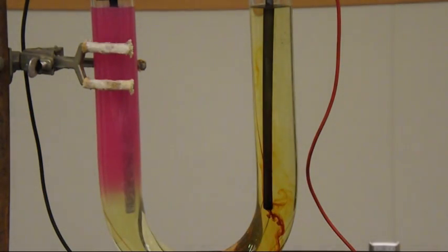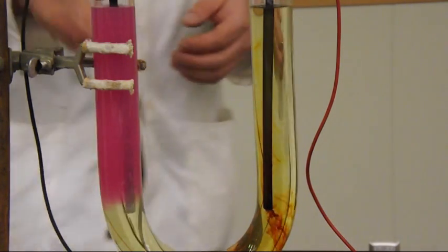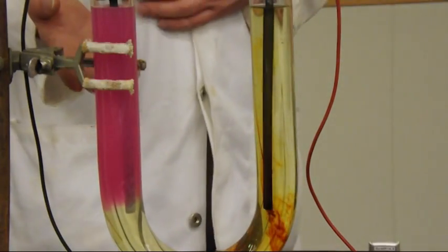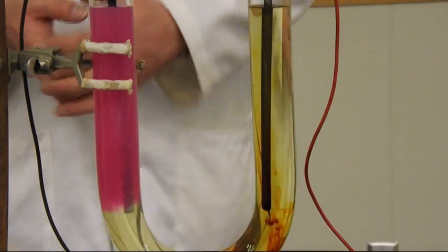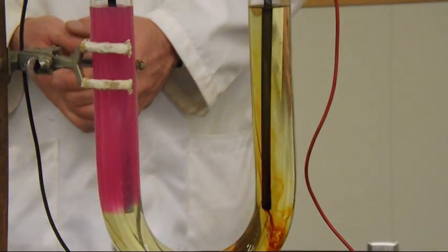We have a pink color being formed there. That was the acid base indicator indicating that we've got a basic solution now being formed. So off of the one electrode we've got a gas bubbling off and a basic solution being formed. Off of the other one we've got a brown iodine solid being formed as it goes down.